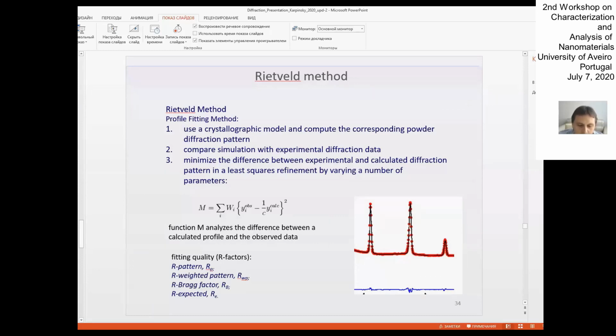This is only one part of the software set. As I said, there is a package, and there are some instruments which can be useful to get information about the symmetry and make the initial steps.